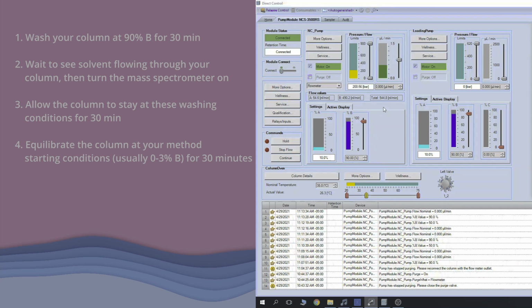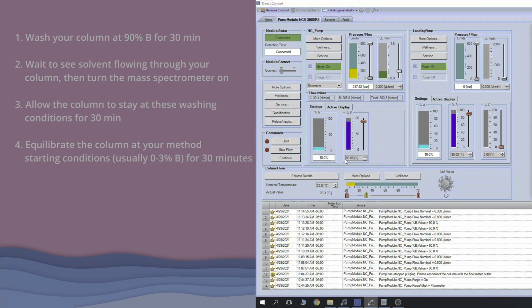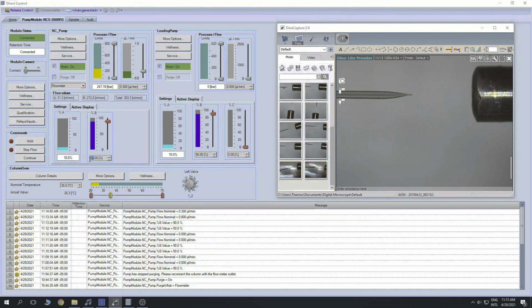Following that, you'll come here and switch your solvent composition to whatever the starting conditions of your method are. For this one, my starting conditions are 2% B. Again, once the column has reached its appropriate pressure, which for this column is about 400 bar under these conditions, you'll want to let this equilibrate for a further 30 minutes while you prepare your samples.